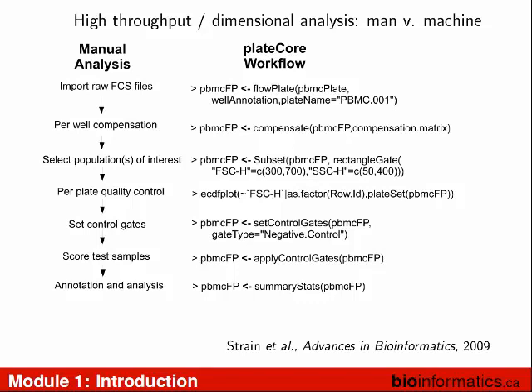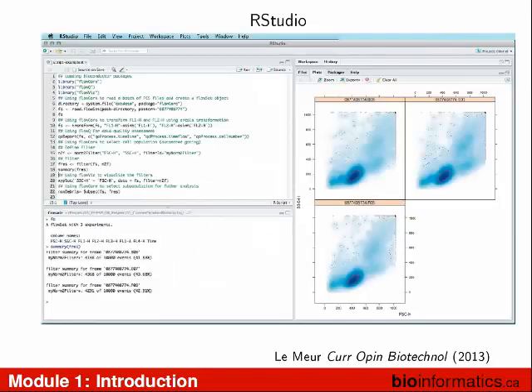So this is a plate core workflow we published back in 2009. All we're doing is automating what you're doing by hand. So we're going to use R Studio. So there is some clicking. You like clicking? We like clicking.